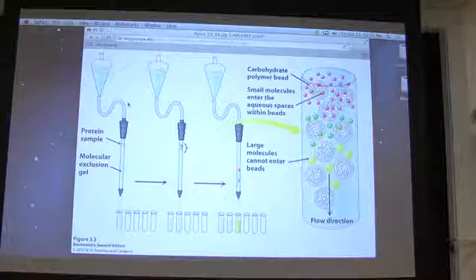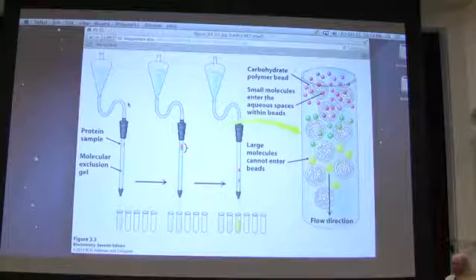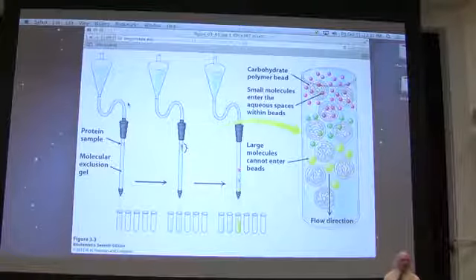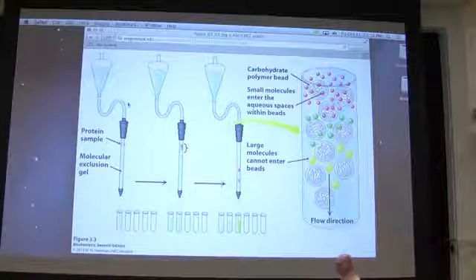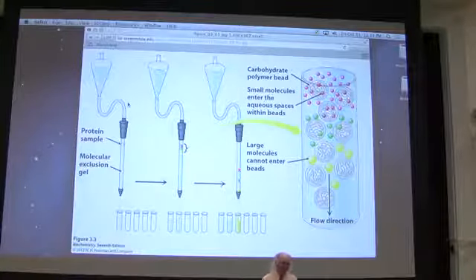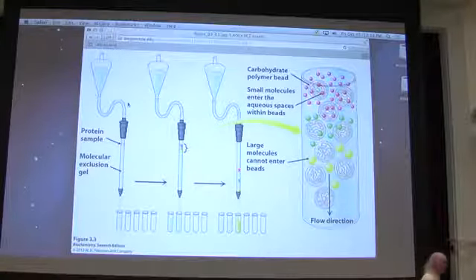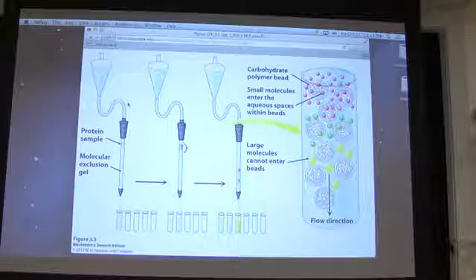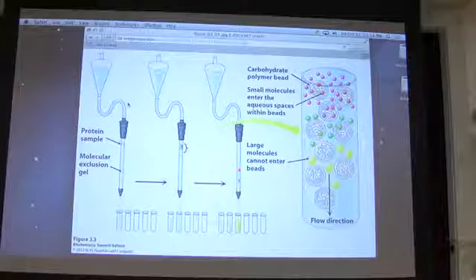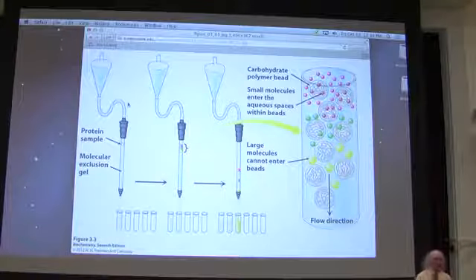So what you do is you will collect a few drops in a tube, then you'll switch to another tube, switch to another tube, another tube, and then you'll use other analytical techniques to tell you what was in that tube. Good question. Yeah, Kimberly. Very good question. Does the structure of the protein change as it goes through the beads? Hopefully not. But remember that structure of protein is very critical, so your question is very relevant. If the protein structure changes as it's going through the beads, we might end up with protein that's pure or relatively pure, but it's not active. So that's a consideration sometimes, and that's why the choice of the buffer that we use is very, very carefully done.